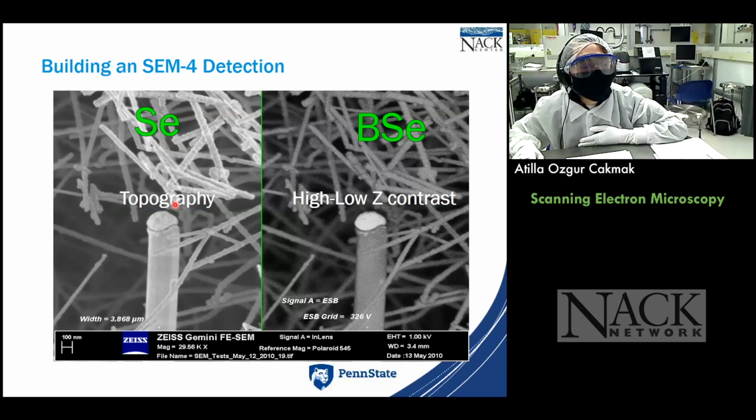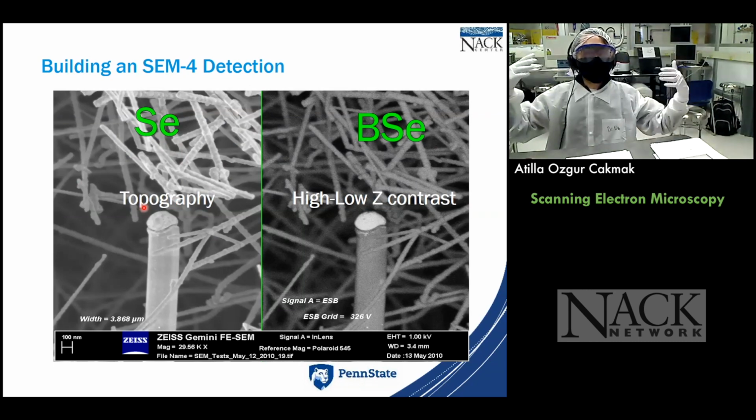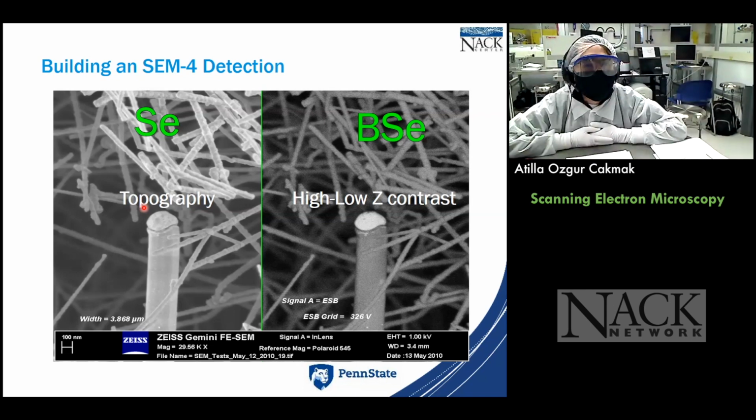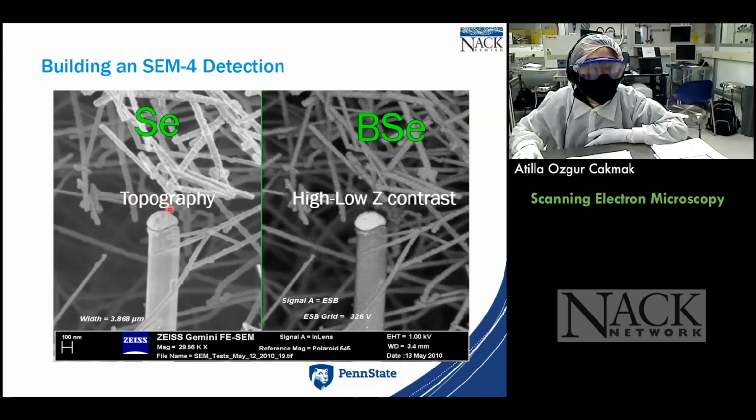What do I mean by that? When we see a sample, our senses are multiple, right? We sense it, we taste it, we smell it, all those things. In nanocharacterization, we have a similar thing too. We do not just see the sample. This is a nanowire, and you're looking at just the topography with a certain detection mechanism. That's good, but you can do more.